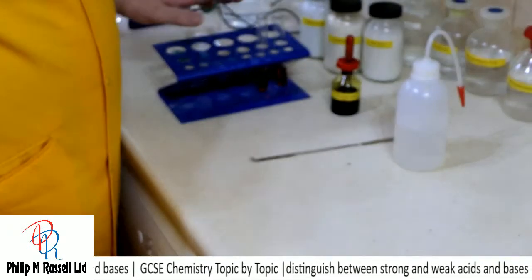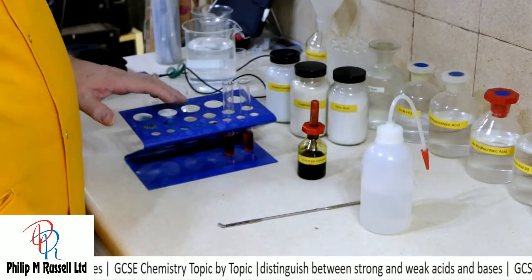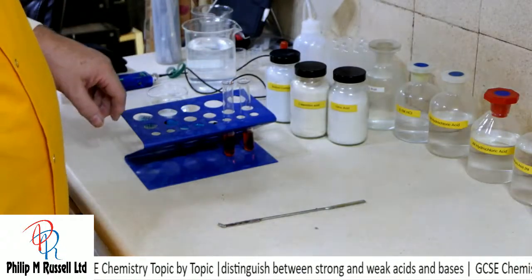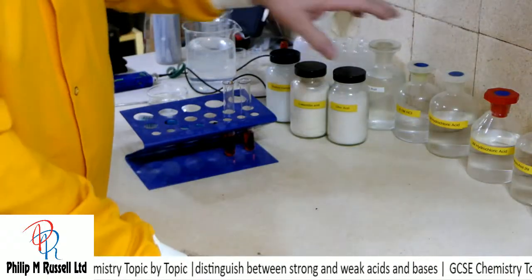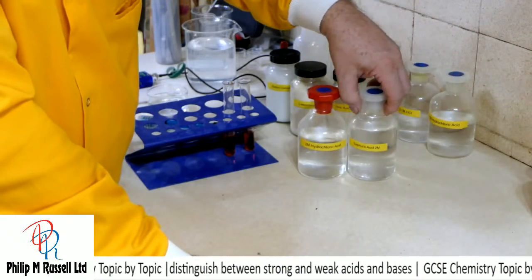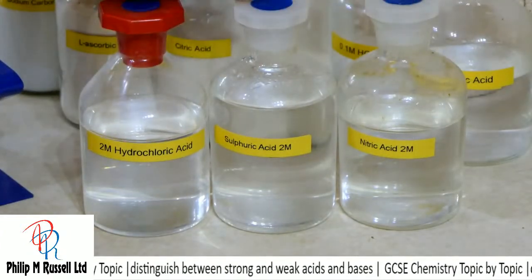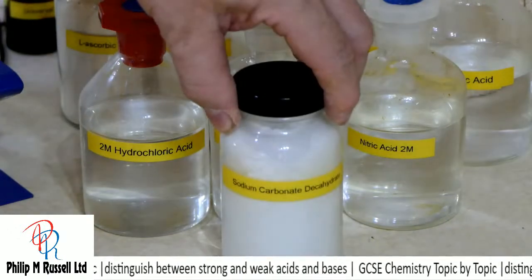So if we're going to try and compare some of our acids, one of the things that's fairly important to do is make sure that we have similar concentrations to try these out. So let's have a look at the relative reactions of these three acids. We're going to look at nitric acid, sulfuric acid and hydrochloric acid, and I'm going to react those with sodium carbonate.